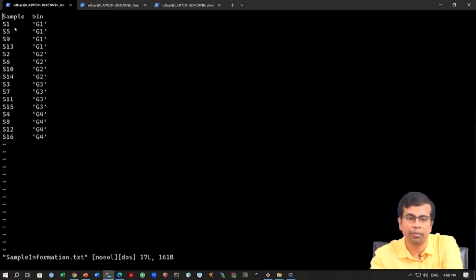The S1, S5, S9, S13, the first 4 samples, belong to group 1. This is mentioned here. The next 4, S2, S6, S10, S14, belong to group 2. Then we have S3, S7, S11, S15, which belong to group 3, and the last 4, S4, S8, S12 and S16, belong to group 4. So, this bin actually gives the information about the experimental design. We will use this information when we go for differential expression analysis.